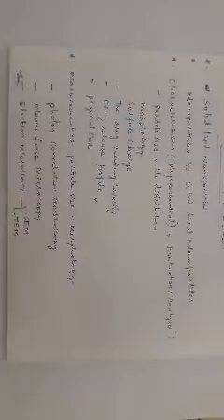So we can say that the Zeta sizer is used in the design and development of new nanoparticles or new nanomaterials for various applications, for example, for drug delivery.